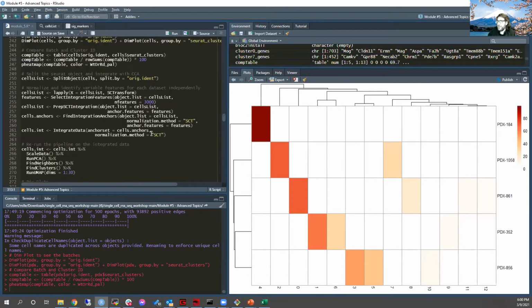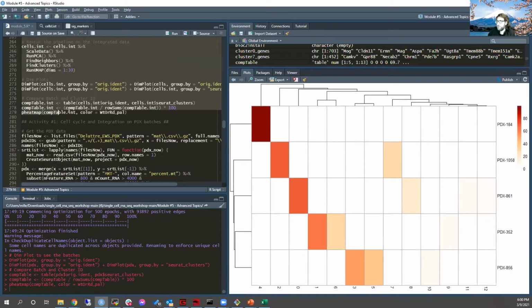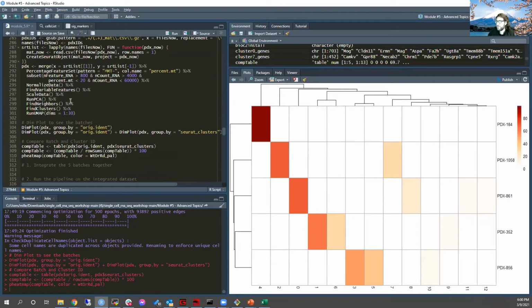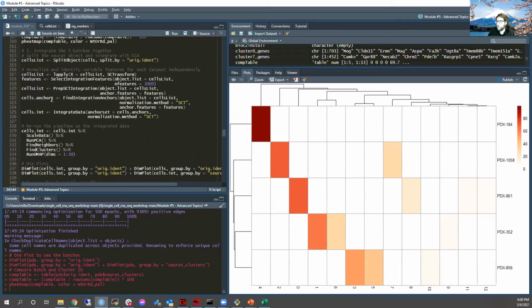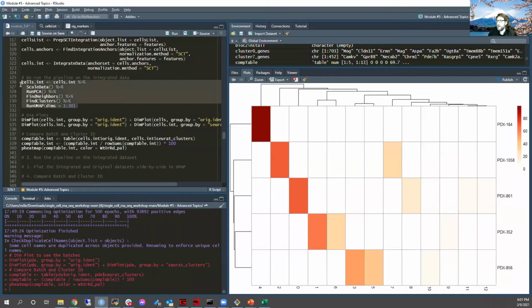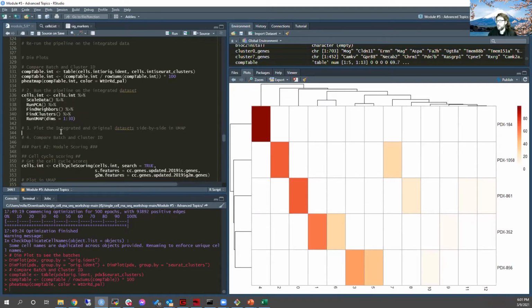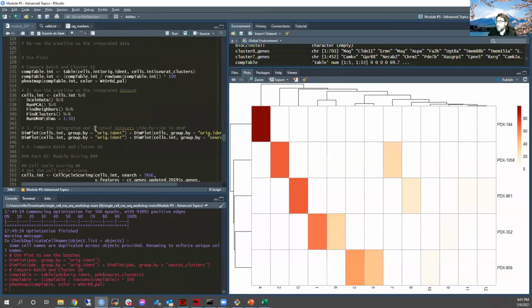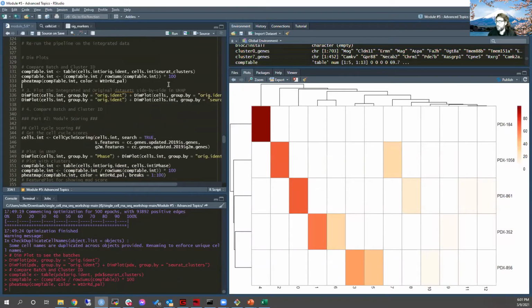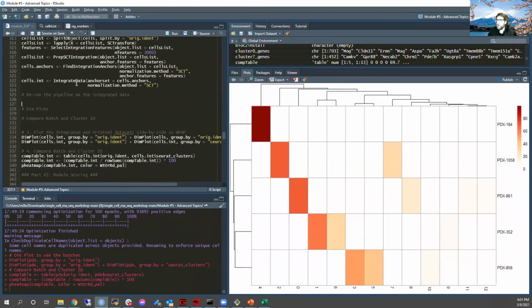So the easiest way is just to copy and paste. So that's what I'm gonna do. Copy, and paste, and we'll clean this up a little bit. So get rid of that, get rid of that. This belongs here. This belongs here. And then this is basically it. Okay.